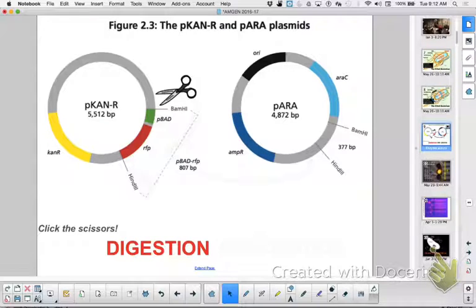Yeah, I don't want it to recombine with itself, okay? Because I decrease the odds that it'll recombine with itself, and also the second reason is, remember we talked about different ways DNA can change, additions and deletions, and we talked about inversions. We want the gene to go in this direction. So we decrease the chances that it gets flipped in like an inversion, because there's only one way to paste this in here.